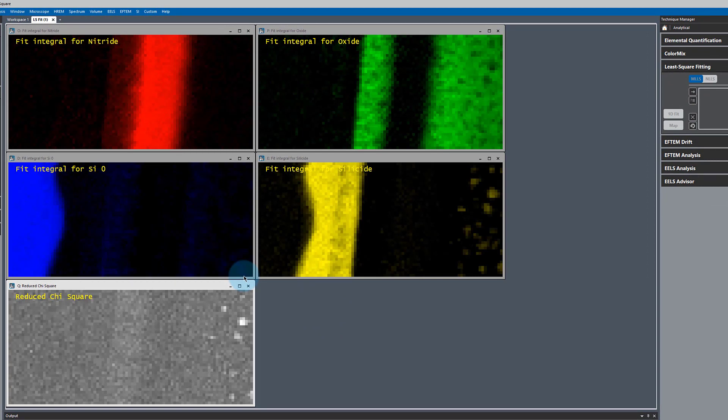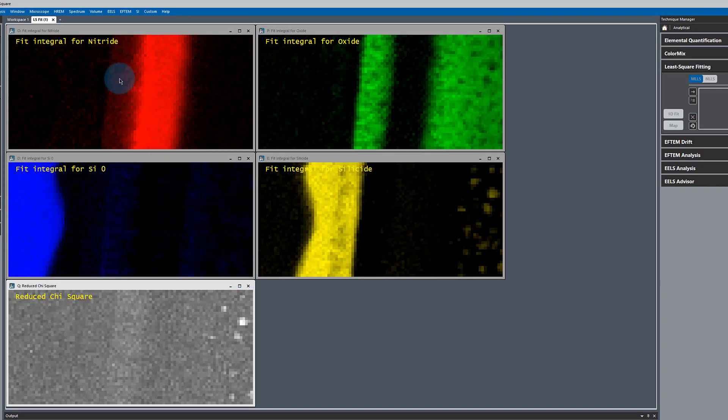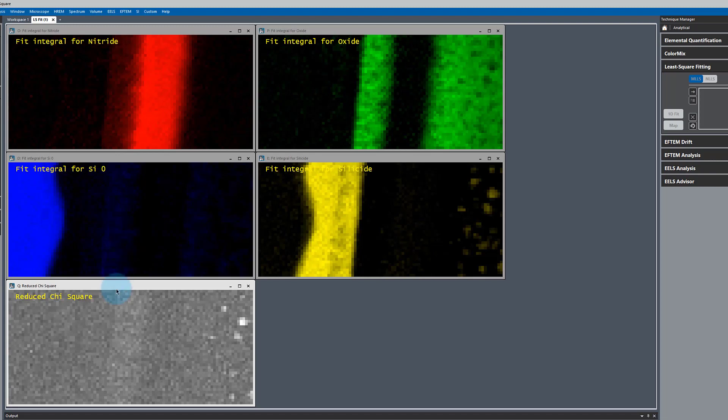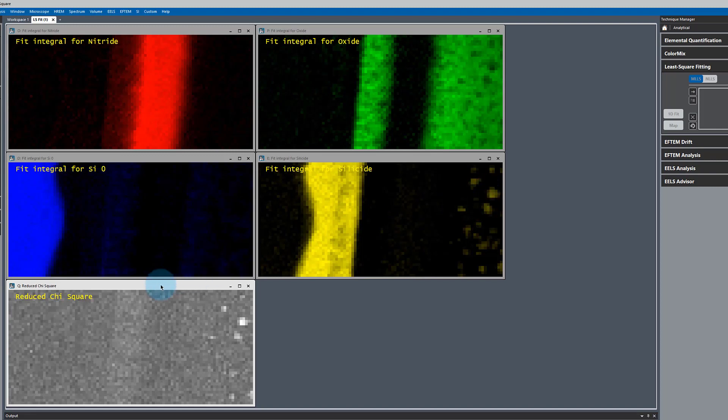We see that we get really good fitting over most of the regions of interest. It looks like this region here is actually represented pretty well as a sum of these two, a little bit of this guy thrown in as well. But the reduced chi-squared is telling us that we missed something important in our data. And that thing that we missed appears to be another phase. It's adding some of this in to fit that phase, but it's not doing a very good job.